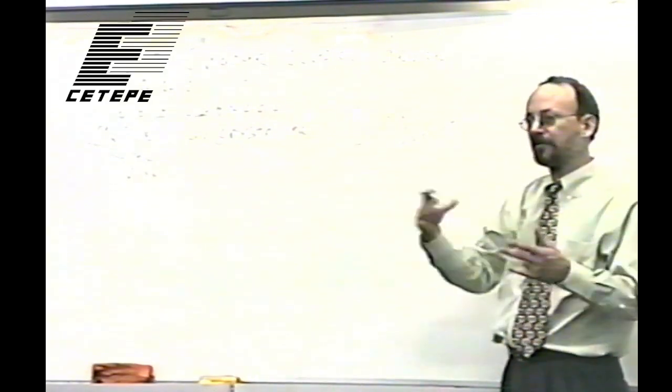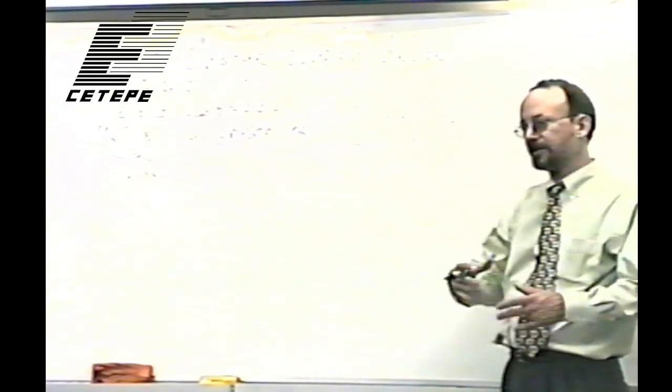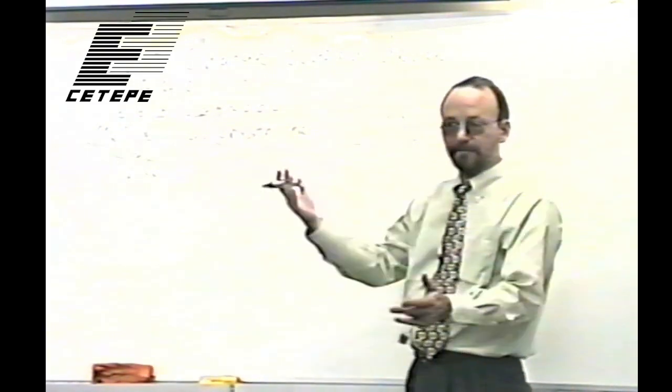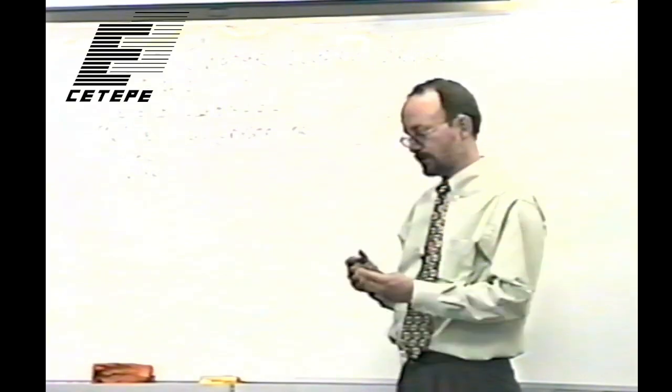Okay, and so that number of electrons, or that charge on the output, would be proportional to the input of photons. So you can develop this electronic image where the bright and dark, or the high numbers, correspond to lots of photons, and the low numbers correspond to low photons. So you can make an image like this.